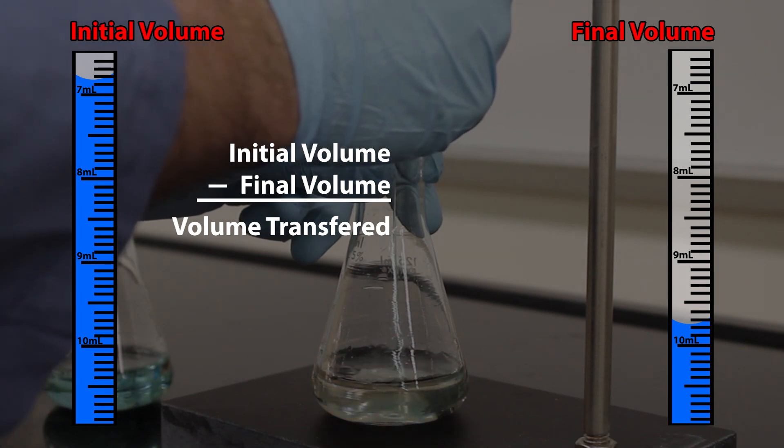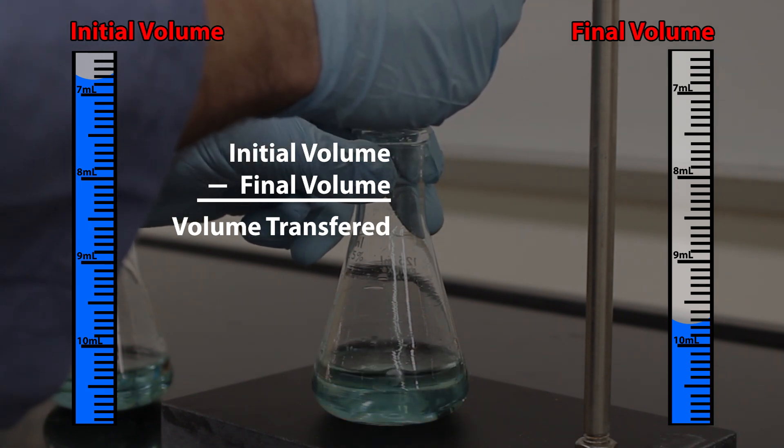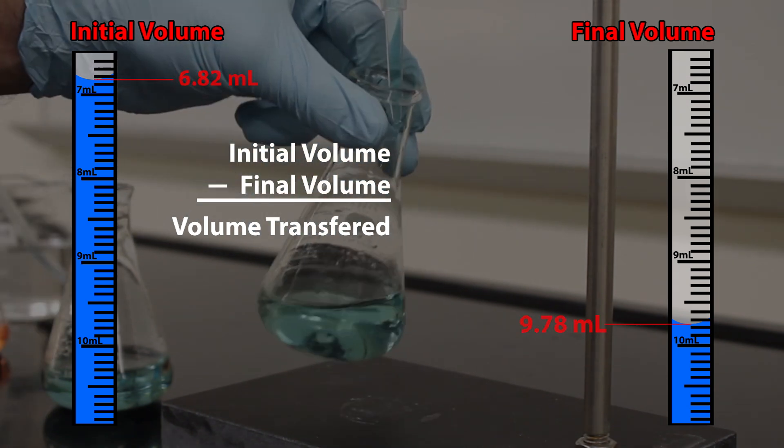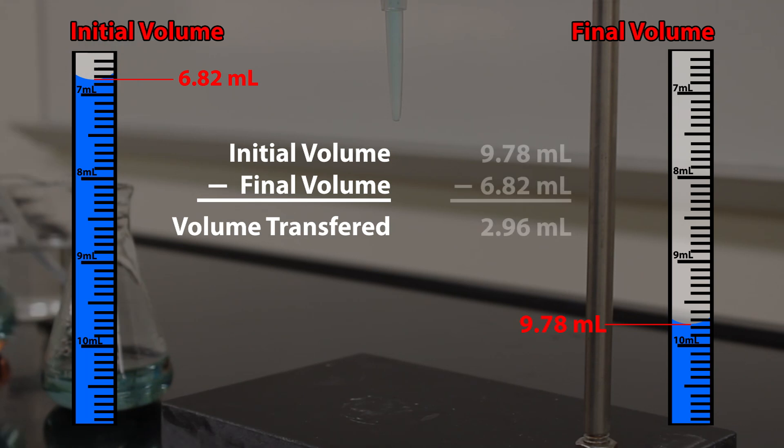Just remember to use the correct number of significant figures. Since there are graduated lines for every tenth of a milliliter we are going to record to the nearest one hundredth of a milliliter for the correct number of significant figures.